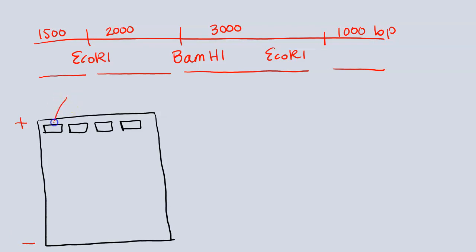When we do this in person, you'll see that we actually attach an electrode to either side. So we load our DNA sample into this well. DNA is negatively charged, and this gel is like a really thick jello. And what it's going to do is pull the DNA through that gel, and it's going to run based on size. So we've already learned and observed several times that larger molecules move more slowly.